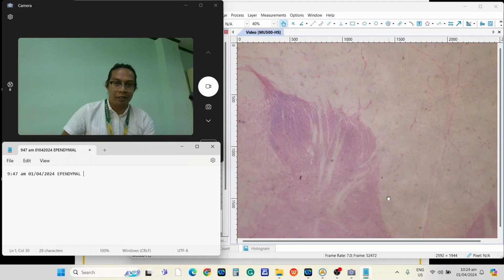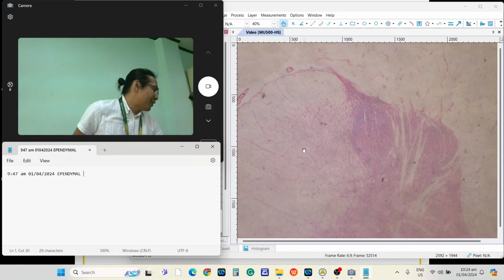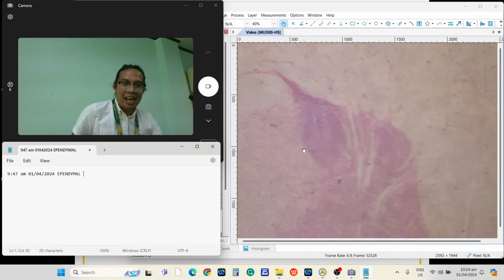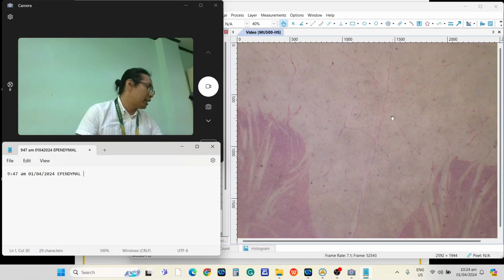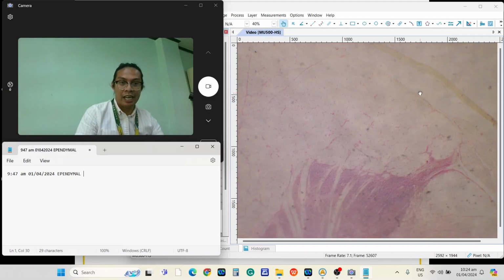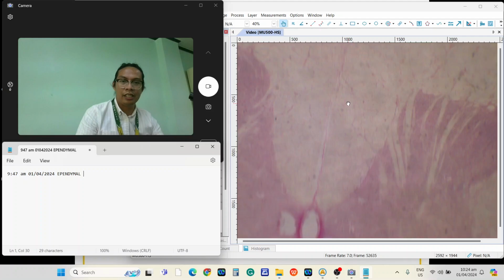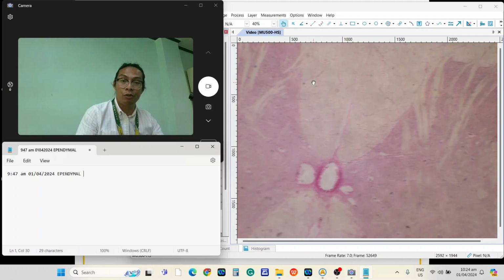Now, punta na tayo dito sa white matter. So, this is the white matter. Ba't siya tinawag na white matter? Kulay white. Okay? So, makikita lamang natin sa kanya ay different regions. Itong nakikita natin sa ibabaw, in between the dorsal horns, that is the dorsal funiculus. Okay? Yung lahat na yan, hanggang dito, hanggang dyan, at ito, that is the dorsal funiculus.